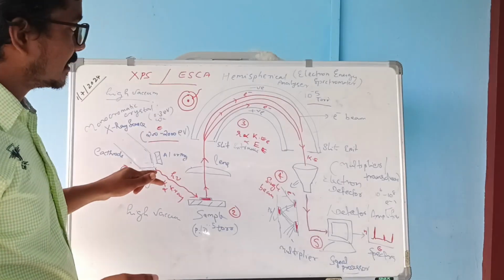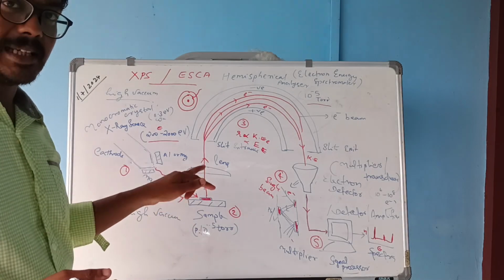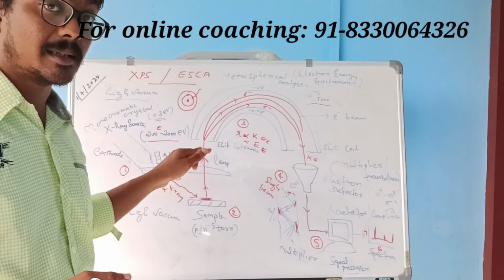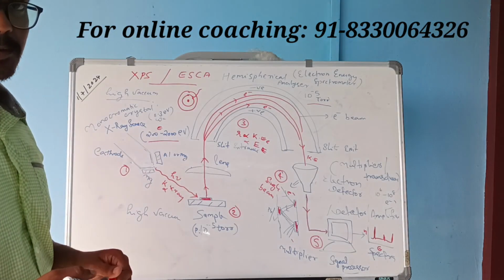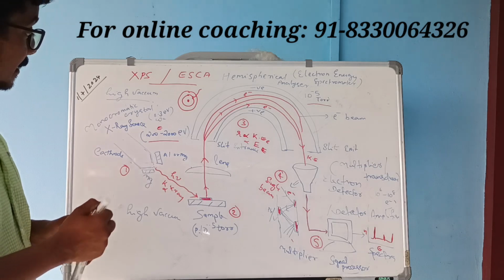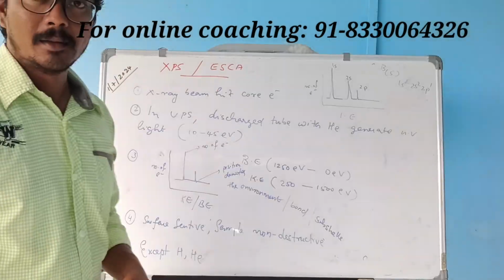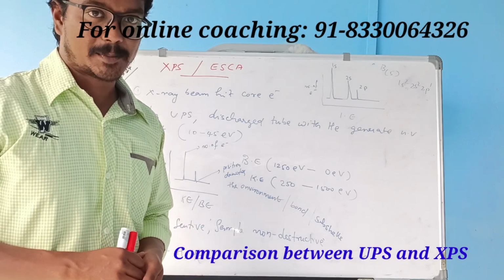This is the technical or experimental illustration, the schematic diagram, that's the correct name, of XPS spectroscopy. You should draw this for your reference. So we have learned the schematic diagram of XPS spectroscopy.